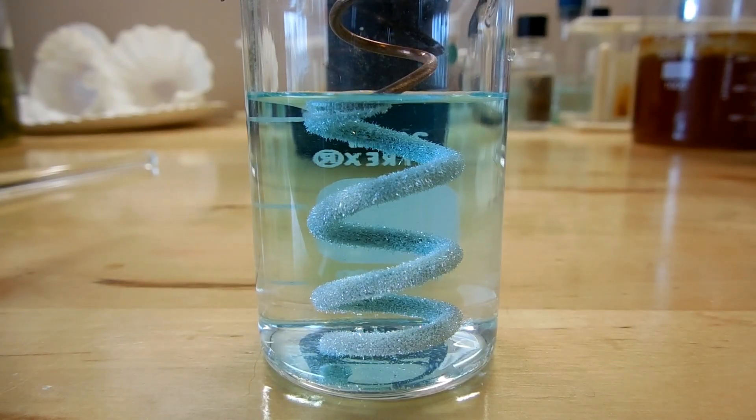Now it's only been a few minutes and we can see there's a really clear change that has happened. So we started out with a clear solution, which we put a reddish metal into. And now what we're ending up with is what looks like a white or silvery colored metal, and the solution is starting to turn blue. This is one of my favorite demonstrations to do for kids to show them some of the cool stuff about chemistry, because it's really easy to set up and you get such a drastic change. It's very very impressive to them.